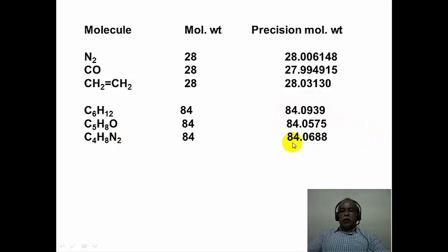So if a mass spectrometer can measure the fractional weights accurately to 4 decimal places, that will lead to the calculation of the molecular formula from the fractional weight. So the high resolution mass spectrometer is an extremely valuable tool. It essentially gives you the molecular composition very nicely from the fractional molecular weights.